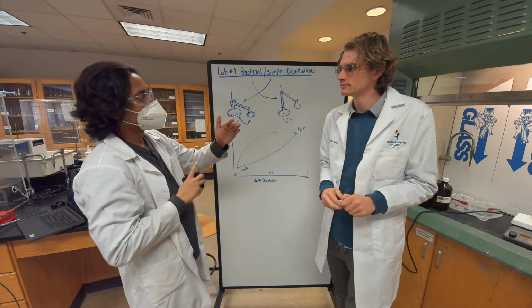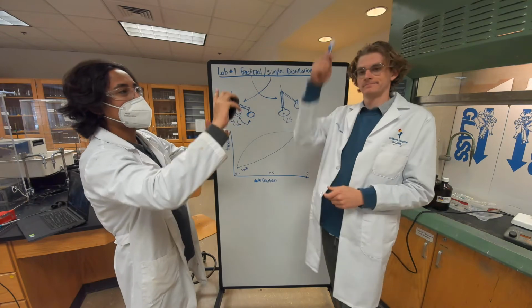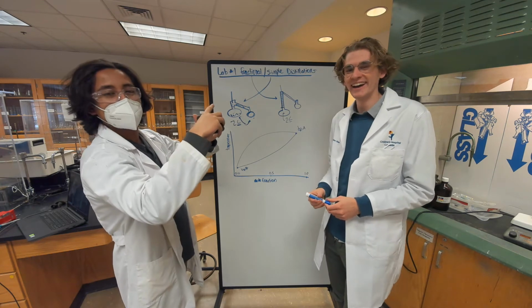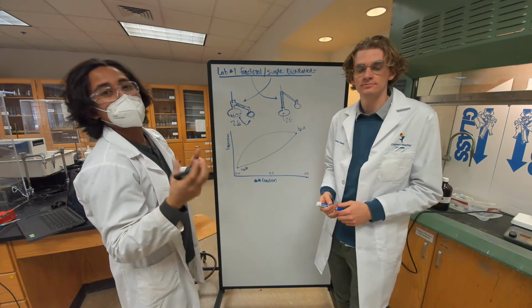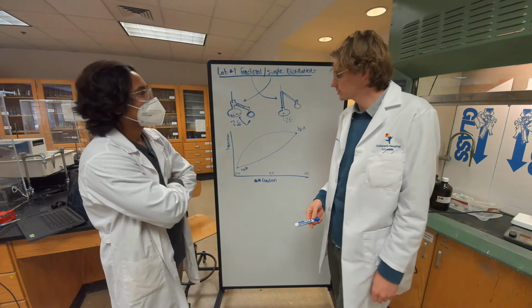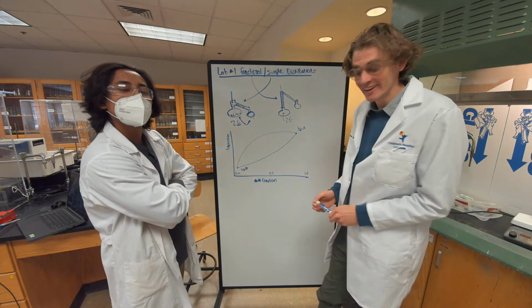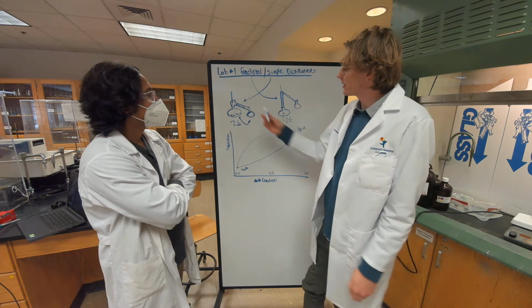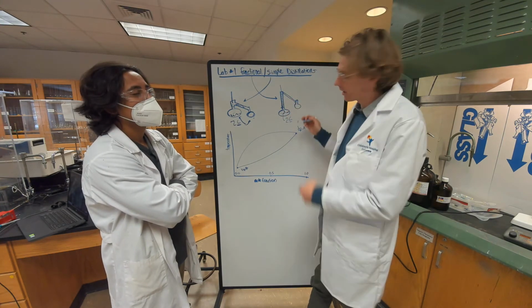What happens is it will first hit there, and come down. If it has more energy, then it will go up and hit and also come down. So it's just like having more of those surfaces in the condenser, which will help us separate those two liquids very easily. If you want a really complex explanation, you can go talk to Dr. Sandra Eaton and get the full thermodynamics, as Roman and I were given that explanation. It is very difficult. But the easiest way to think about it is it's just a whole bunch of small, simple distillations. The liquid evaporates and condenses onto one of the pieces of the packing column.